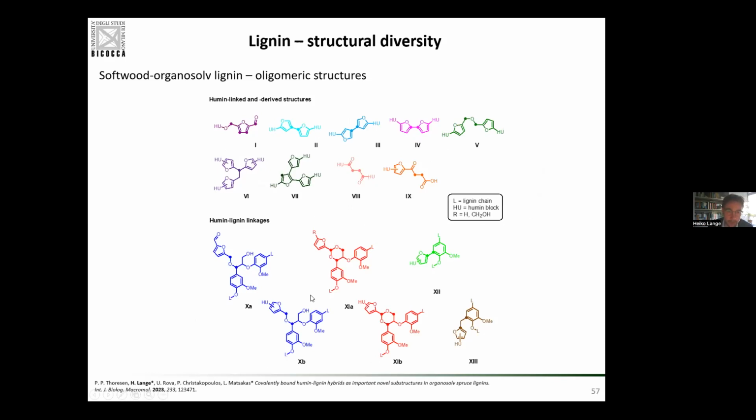So, as a function of the process parameters, the NMR analysis revealed that we can have something that is a natural polymer, in the sense that the ingredients come from nature. One is sugar-derived, one is lignin-derived, but then we've joined them together in our processes. So we have a completely different thing. It's not lignin, it's not humin, but it's basically a copolymer. To a certain extent, we have a copolymer in there. And that obviously affects the type of valorization that we can run eventually.